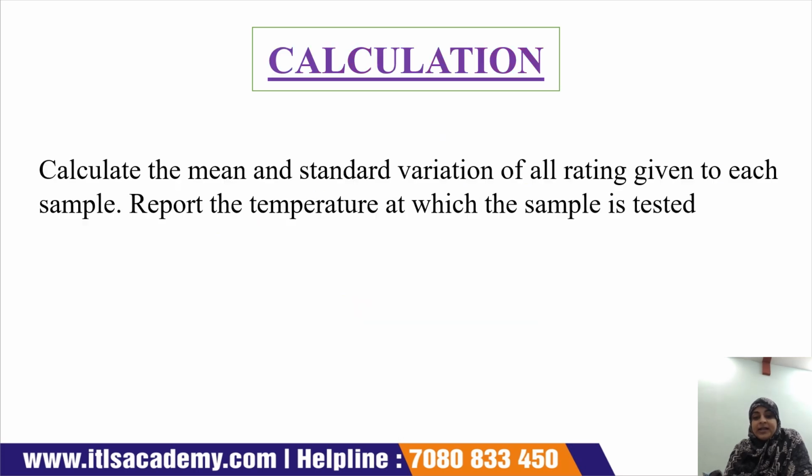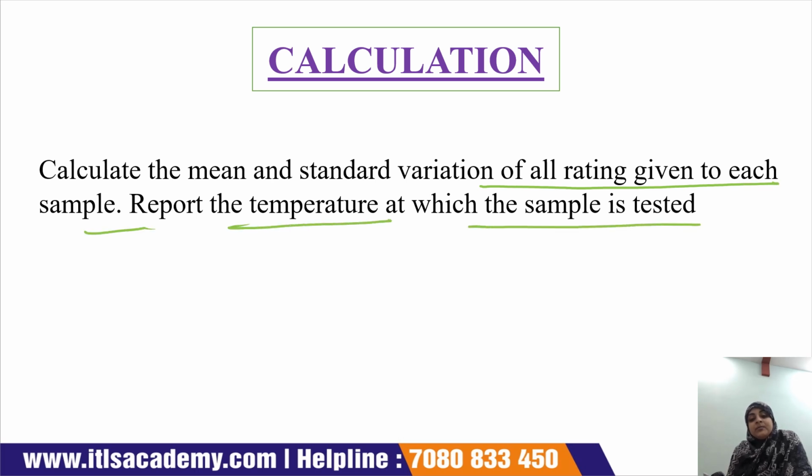Now the next is the calculation: the mean and standard deviation of all the ratings given to each sample, and report the temperature at which the sample is tested. So this is all about the measurement of taste.